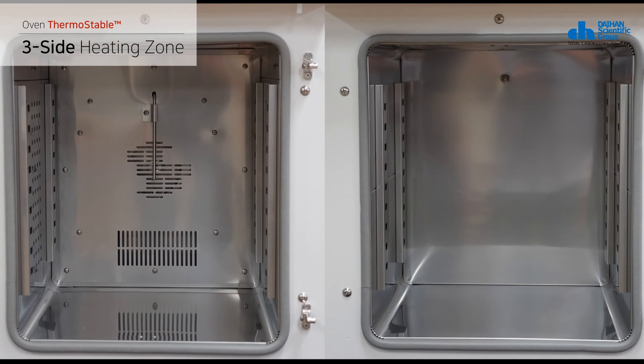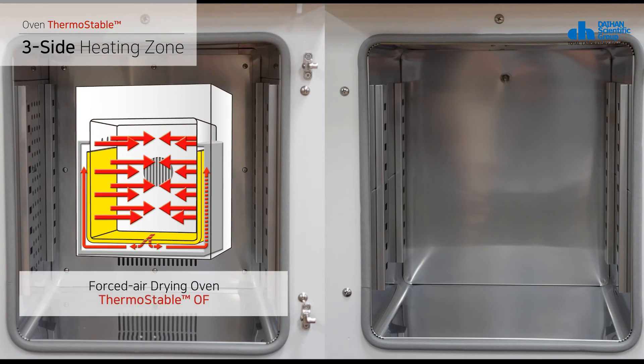The three-side heating zone installed on the product is a high-performance heating mechanism that realizes the best temperature uniformity and accuracy. For the OF model, which uses the forced circulation method, a fan is mounted in the chamber at the rear side. It draws air into the preheating zone where a heater heats it, then circulates it back into the chamber along both sides.